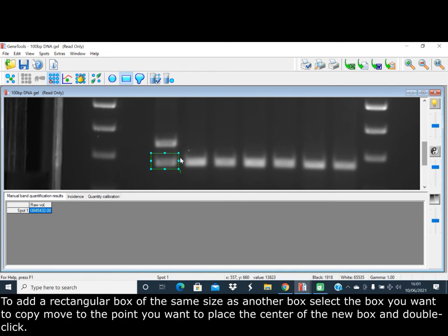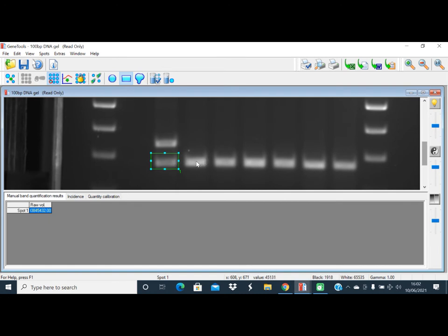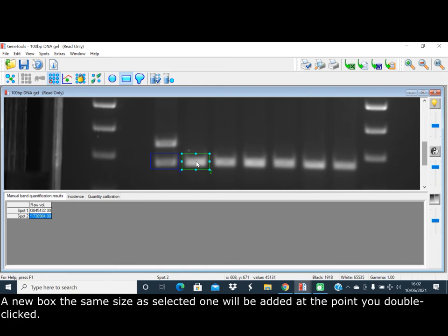To add a rectangular box of the same size as another box, select the box you want to copy. Move to the point you want to place the center of the new box and double-click. A new box with the same size as the selected one will be added at the point you double-clicked.